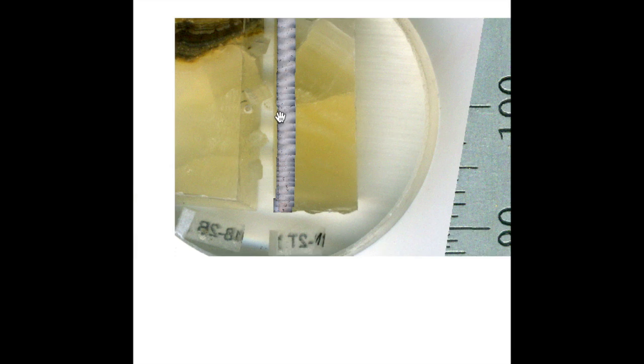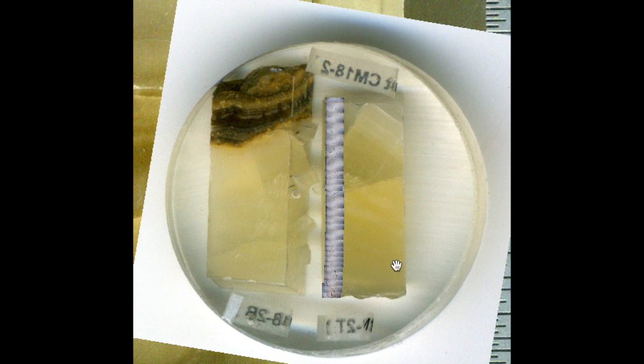But you can see this is only able to be done with the SIMS, and if we were to drill this sample by hand, I would essentially be averaging several of these different seasonal cycles, which is not what I want. So this is the great power of the SIMS and why I feel very fortunate to be able to use it for my PhD.